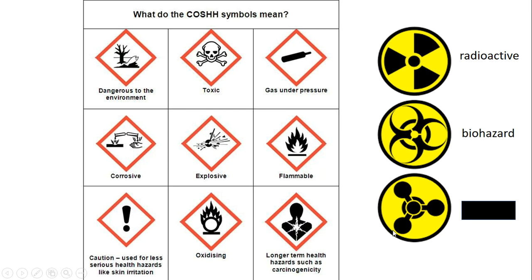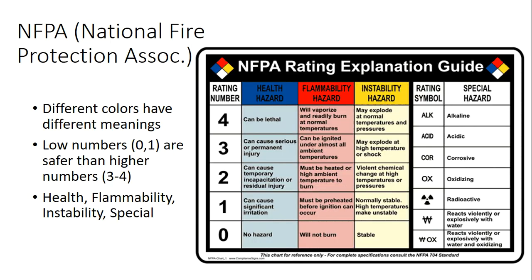This one I was never familiar with until I saw it here for this talk. So I'll just let you know it's chemical, but I don't think I'd ever bring that one up. These are the two you actually see in the world. 48 years of my life, I've never seen that one, and I worked in a chemistry building. But these pictograms are important, and the point of them is they're trying to communicate hazards to you without language being a problem.